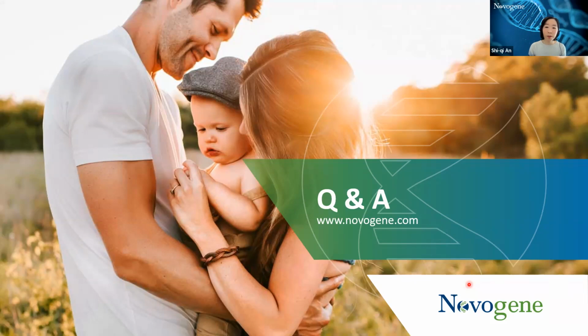So that would be good. But you could sometimes also consider pooling technical replicates together, and then just separate your biological replicates. That way can sometimes help as well. But 3 is the one we recommend as a minimal requirement. But if the condition, for example, is a patient sample, or it's very difficult to control the background, they're going to be very variable, then it's probably worth increasing the replicate number.